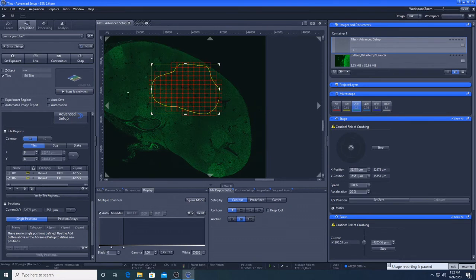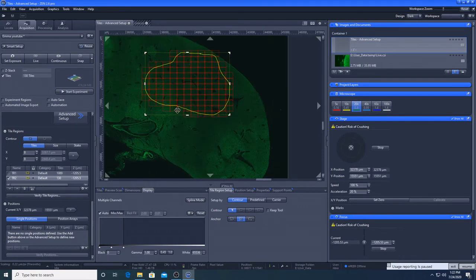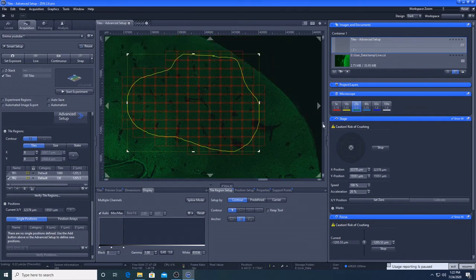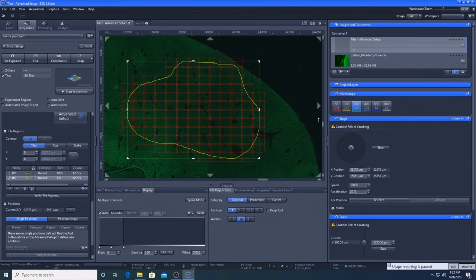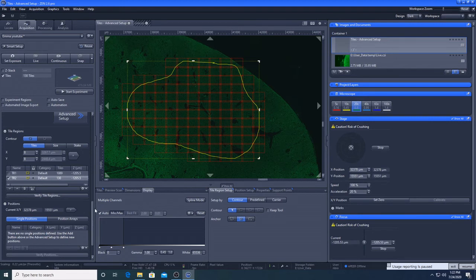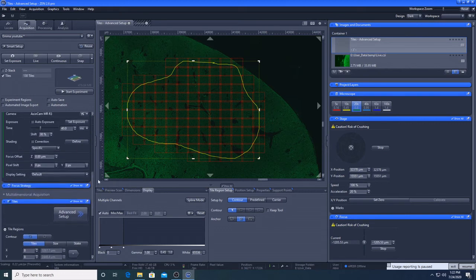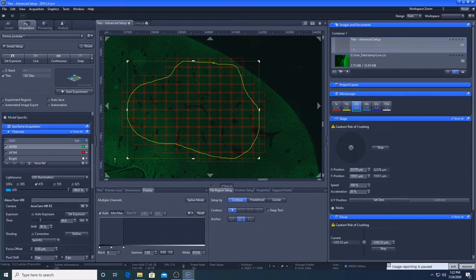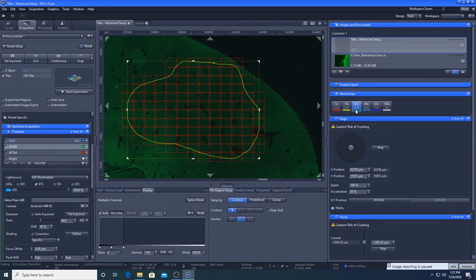So we wouldn't want to use the 20x for the whole kidney. I mean, if you need to image a whole kidney, be my guest. But if you don't need to, don't use that time.